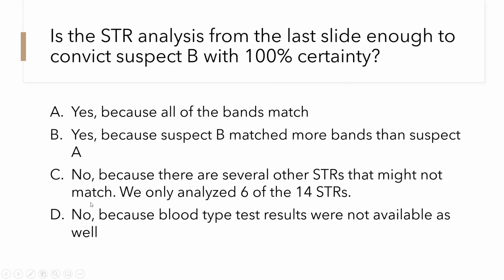So in this case, you would probably want to run another analysis that includes the other 8 STR markers.